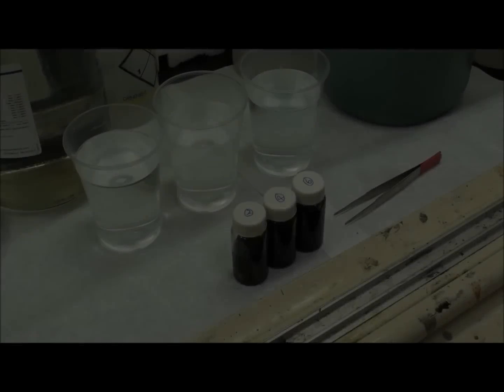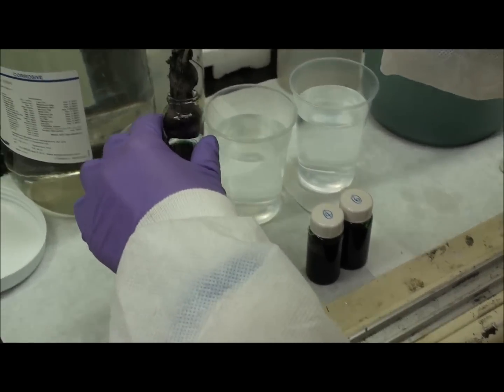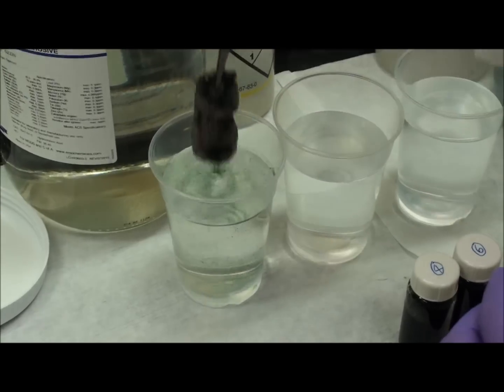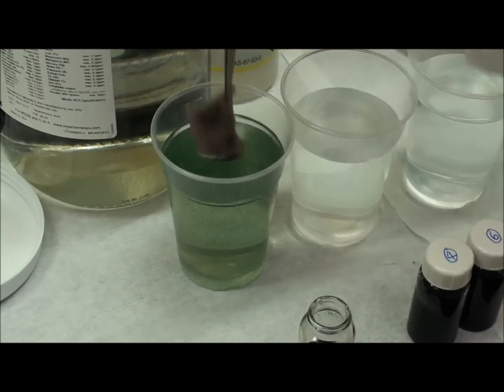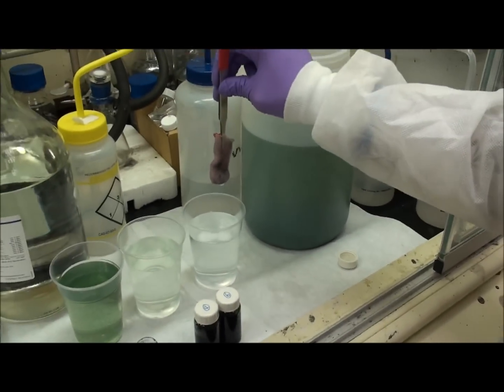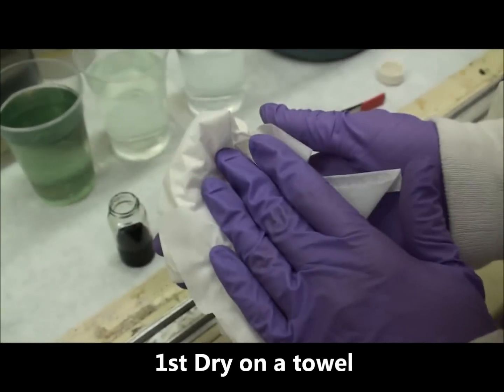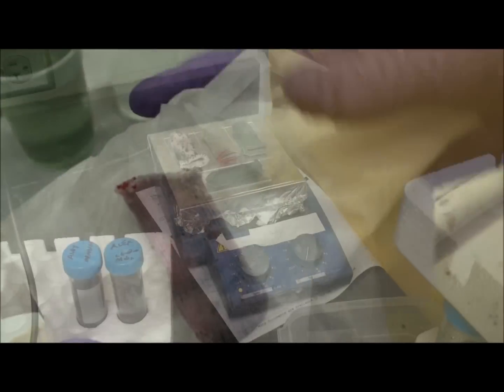Wash and dry. We wash the glove in DI water about three times. First, dry on a towel, and then second dry on a heater.